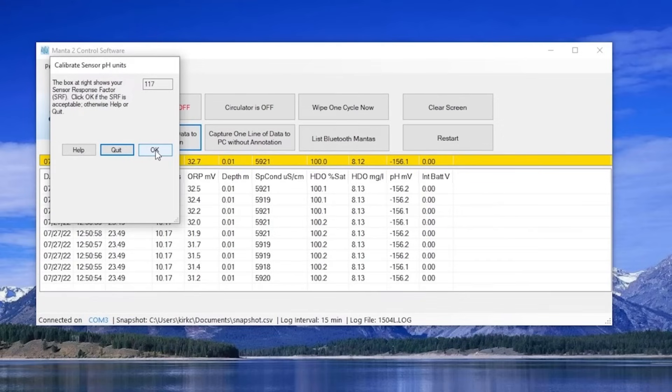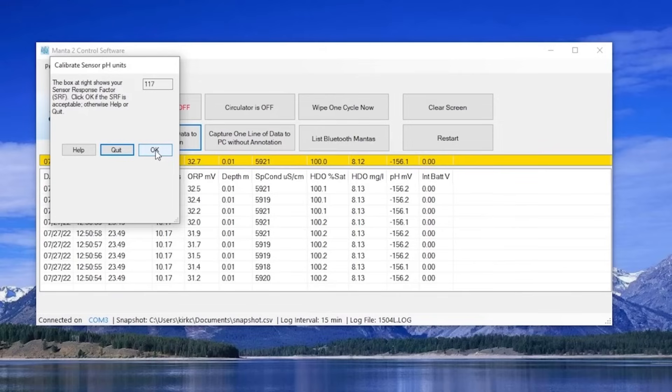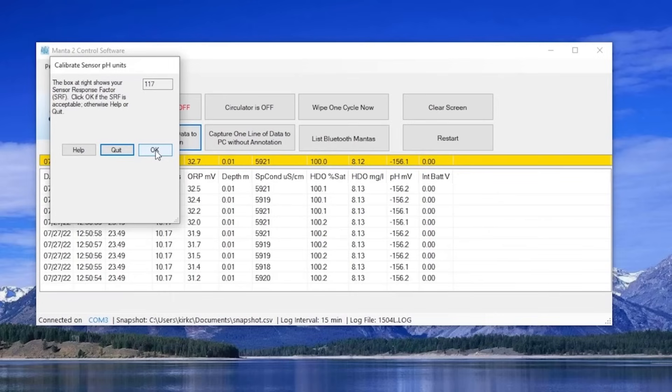On the next screen, you will find the sensor response factor. The SRF is Eureka's unique way to show you how close your calibration is to that of a typical sensor. An SRF between 80 and 120 is acceptable. If your SRF is significantly outside that range, it likely means your sensor needs cleaning, your reference electrolyte needs to be changed, your buffers are faulty, or you mistyped your buffer value.